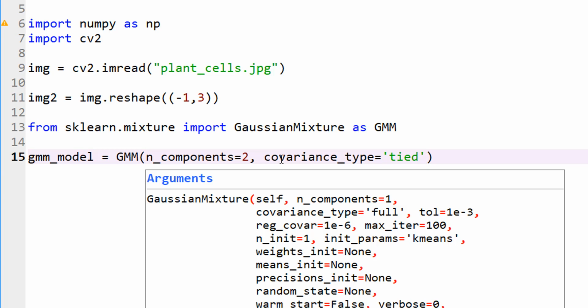The 4 options that we have for covariance are, by default, full. Tied is another one. Diagonal is another option, and spherical. For example, if you choose spherical, I believe it actually constrains the clusters to spherical regions basically. And if you use diagonal, I think it includes, actually full probably includes, these ellipse types of definition of these clusters.